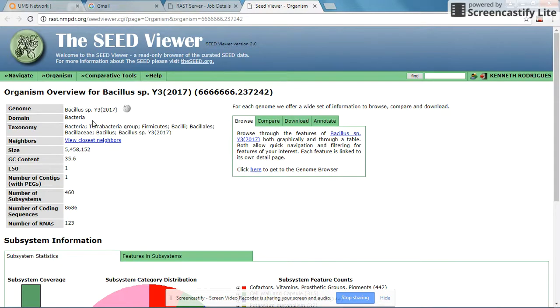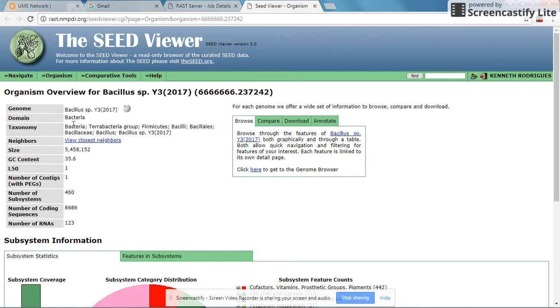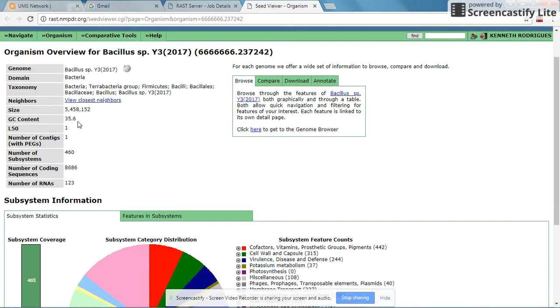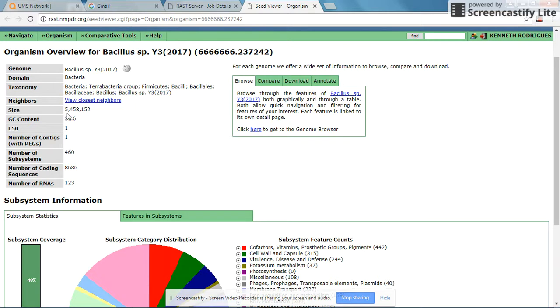The first designation you can see is that it's a genome species. I have classified it as bacteria. I don't know the exact genus, but this is a Bacillus species based on a microbial observation. The genome size is 5,458,152 bases, which is approximately the size of a Bacillus species.